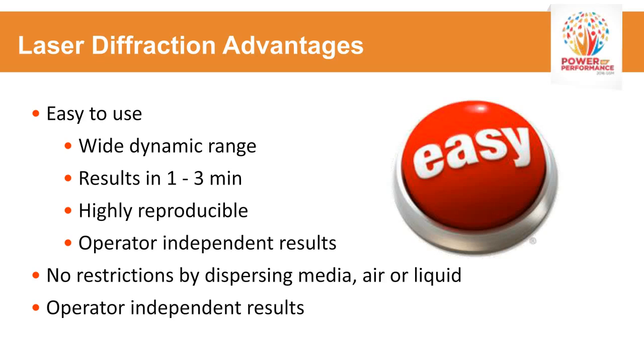So particle systems can be dispersed in that or run in a totally dry state. And as mentioned above, very important is the operator independent results. The instrument doesn't usually care who's putting the sample in, as long as it's a representative sample. That's really the key for any particle size analysis.